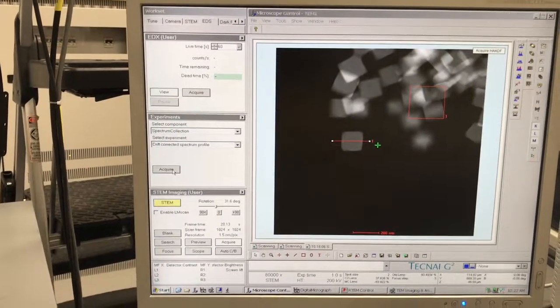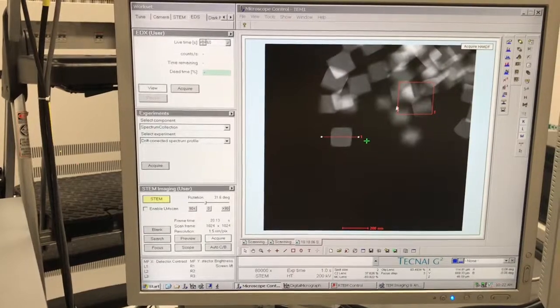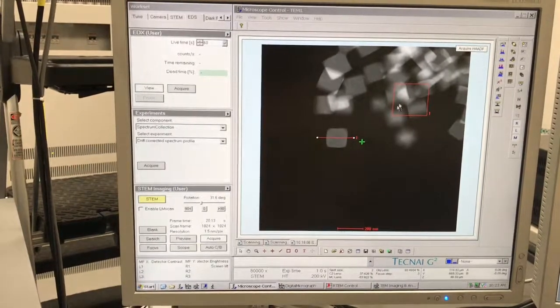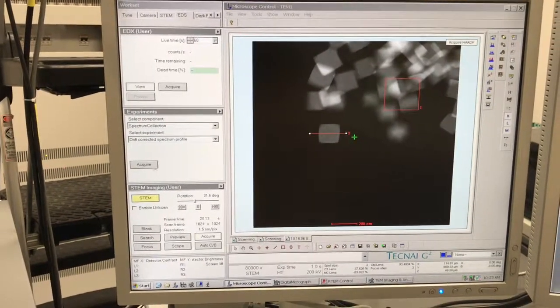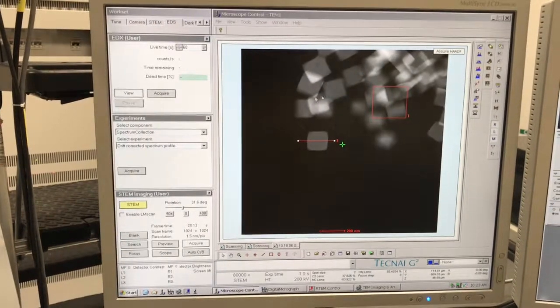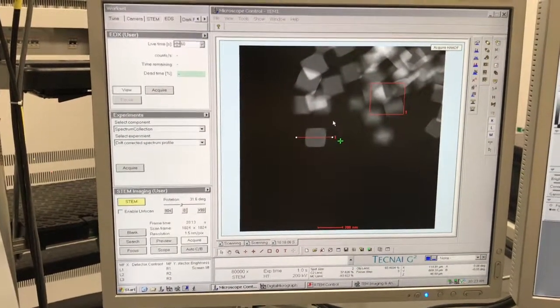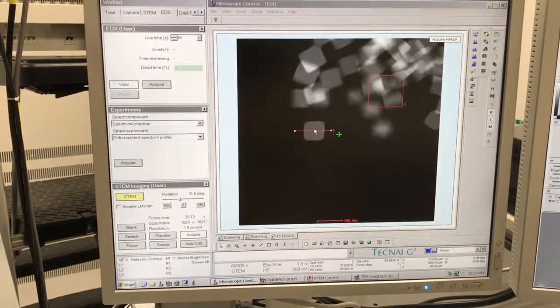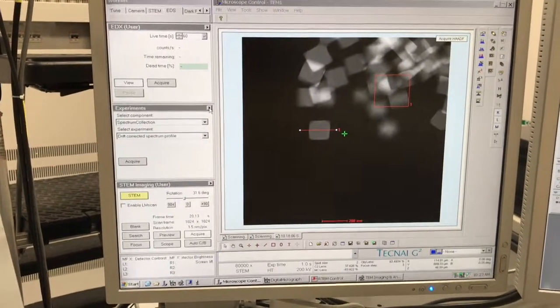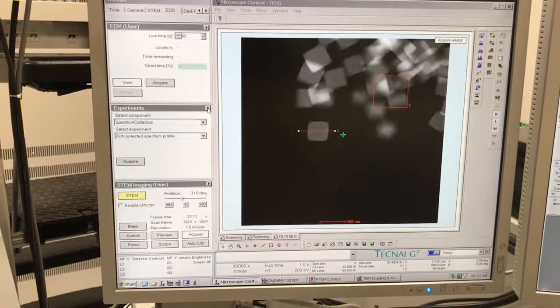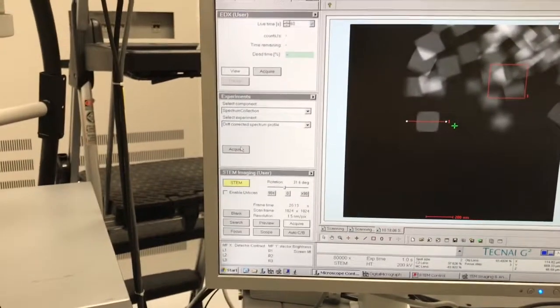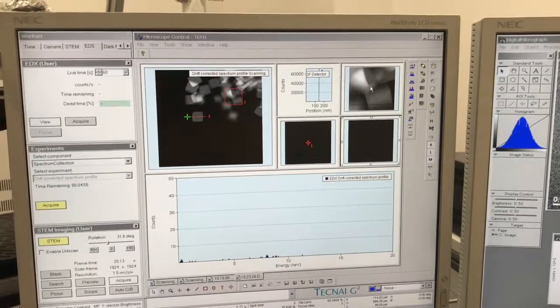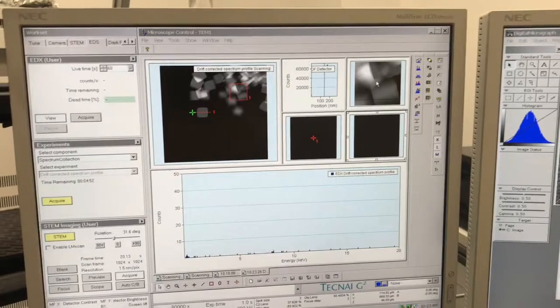We're ready to start the map. In practice you don't want to wait too long — draw your boxes, position your line, set your parameters, and go, because the sample is moving and you run the risk of your particle no longer being under the line. We're doing this slowly for demonstration purposes, so it's not a big deal here. I'll select Acquire.